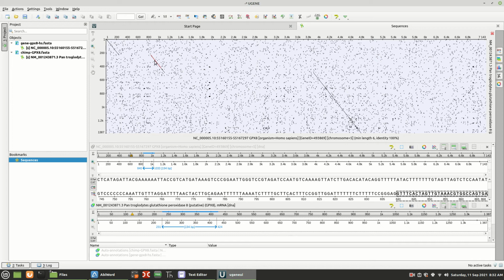Anyways, so you can click on these and see how this becomes slightly red. This one will be too long. That's going to be hard to look at in this manner. So it's probably better to go back, and if you wanted to look at the actual sequences, which you do, you might go back to the BLAST, and I'll do that here in a second. But we can do some other things here.